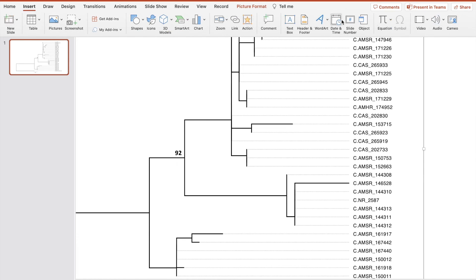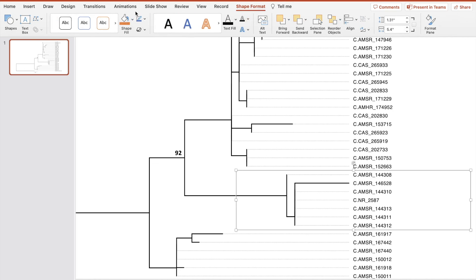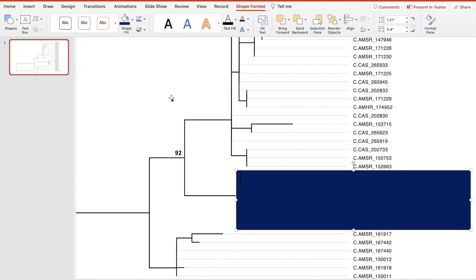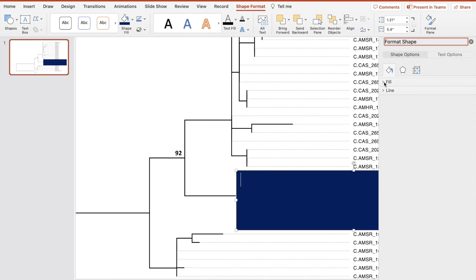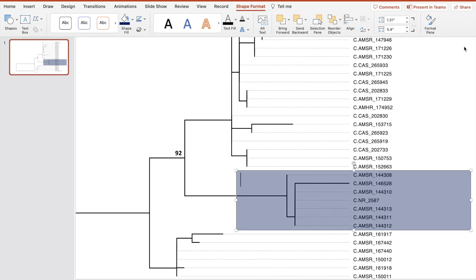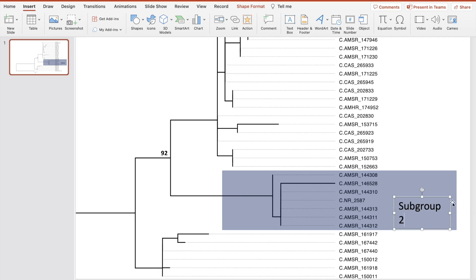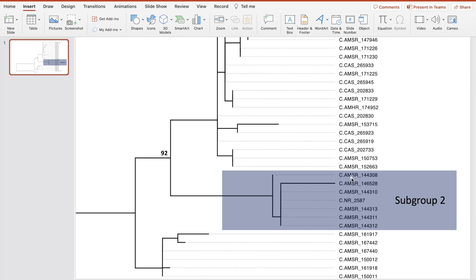Let's also create some highlights. Let's assume this is our subgroup 2. Let's shape the format and fill it. Let's format the pane to increase transparency to 60% — 60% is a good number. Then let's put another text box right here and label it subgroup 2. You also have more options in PowerPoint to put little fancy things like stars or arrows, which can be really useful.